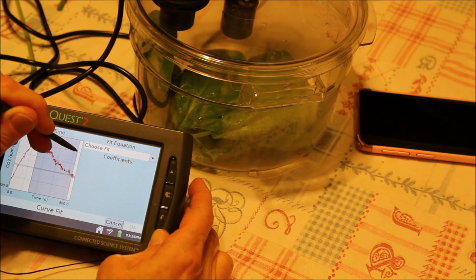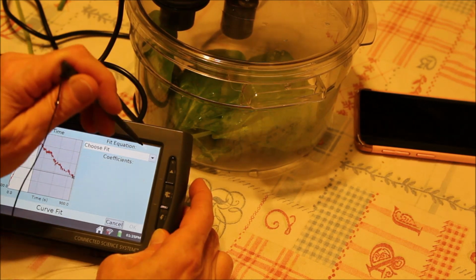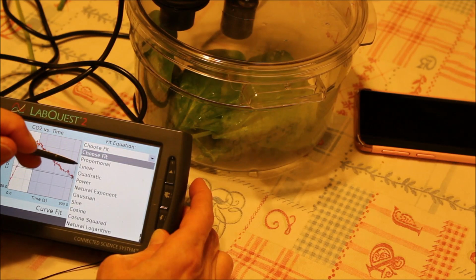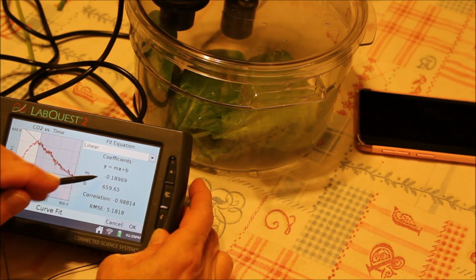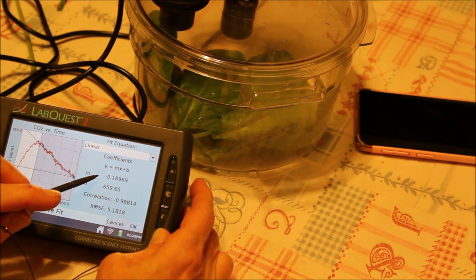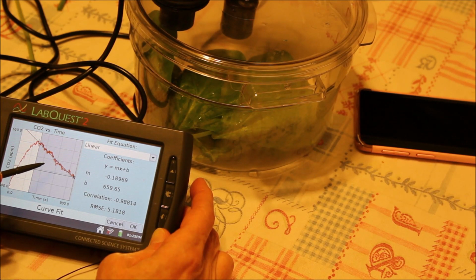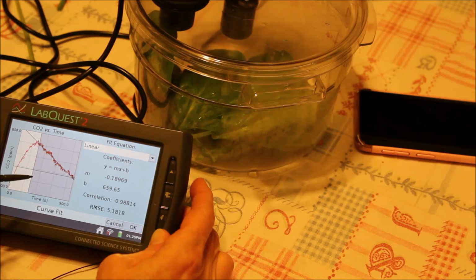You will again highlight where it's going down, choose the curve fit, go linear, and you will get the actual rate. The M is the rate of the carbon dioxide decreasing.